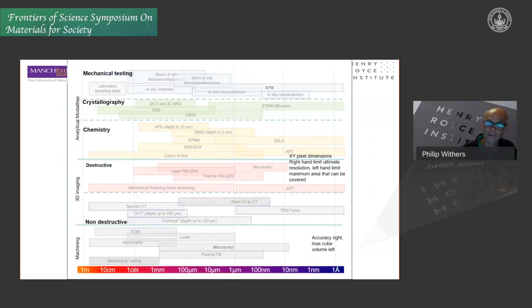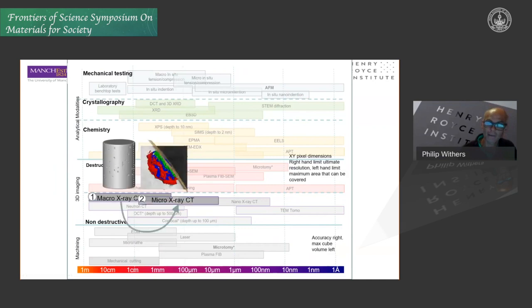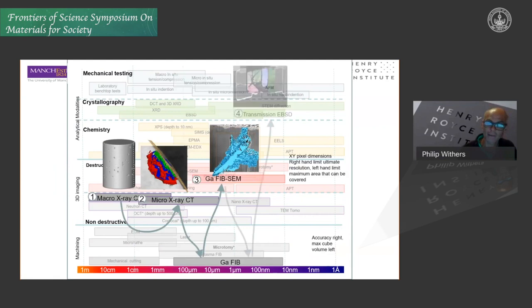And we can map those onto a technique chart, if you like. This is rather a technique palette. And we have a whole palette of different techniques, destructive and non-destructive, where we can pick out the chemistry, where we can pick out the crystallography, where we can measure locally the properties. And each experiment we embark on, we can define different workflows to go down the different length scales, to look at the hierarchical nature of materials behavior, to study the process. So in this case, we're moving down through these different techniques using the gallium FIB as a means of finding site-specific information within the electron microscope and ultimately down to the transmission electron microscope scale. So these kind of workflows can be put together for a whole range of materials behavior and manufacturing challenges.